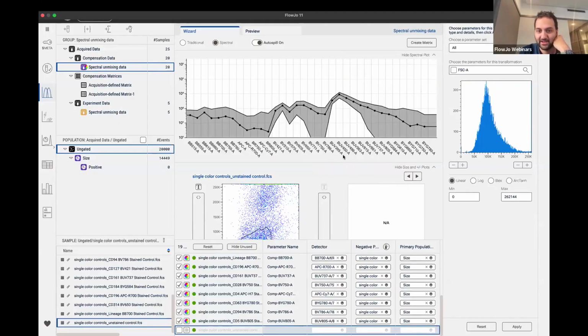Yes, Isabel, correct. BUV450 is the highest autofluorescence channel here. So why don't I create a parameter here, name it autofluorescence AF, and then assign right here the channel that Isabel told us to. It's the BUV 450, this one.